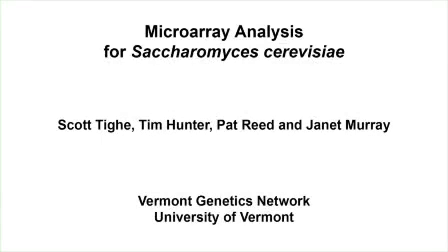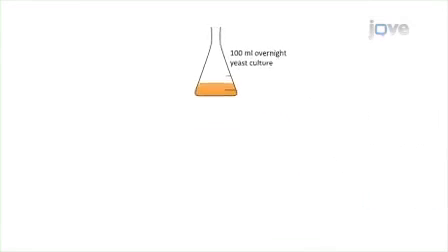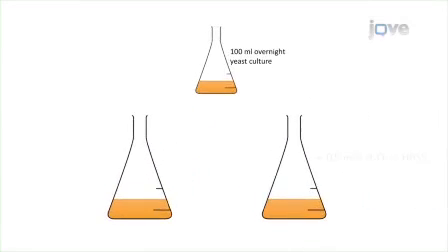The overall goal of this procedure is to introduce undergraduate science students to microarray technology by examining the expression differences in yeast undergoing oxidative stress. This is accomplished by first isolating total RNA from yeast cultures treated with hydrogen peroxide and the untreated controls.